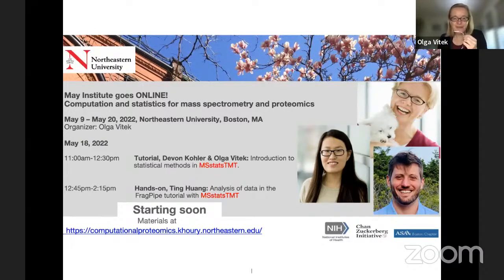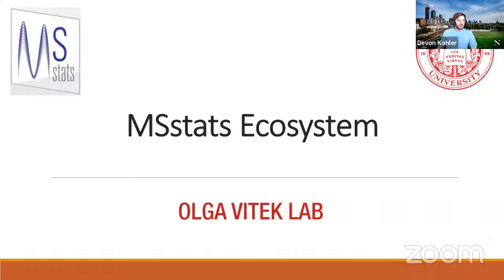So first, we will do the overview of the MSstats ecosystem. Thanks so much. So Devon, you can go ahead. Awesome. Okay, hopefully everyone can see my screen.